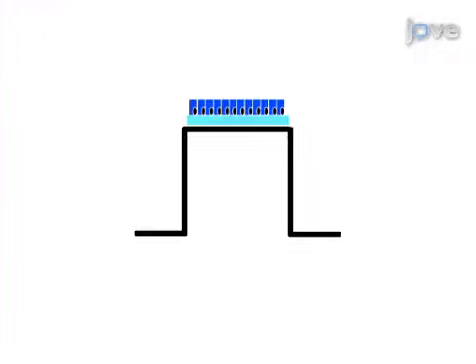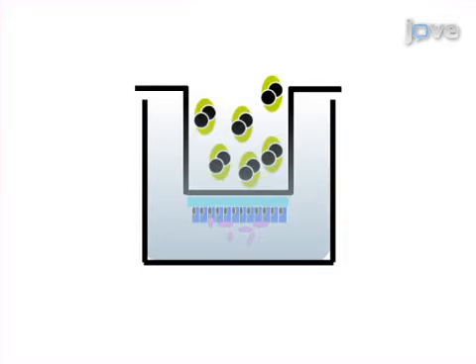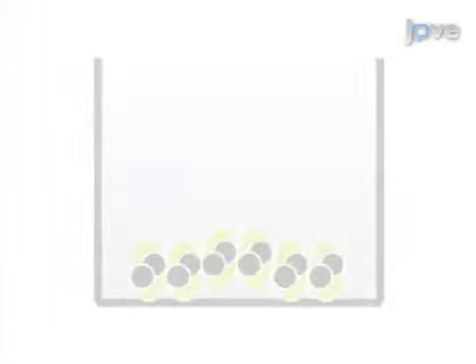As a second step, bacterial pathogen is cultured in order to infect the apical surface of the epithelial monolayer grown on the transwell filters, which causes the epithelial cells to produce endogenous neutrophil chemoattractants. Next, neutrophils isolated from whole blood are added to the basolateral side of infected epithelial monolayers grown on transwell filters for assaying migration of neutrophils from the basolateral to the apical side.